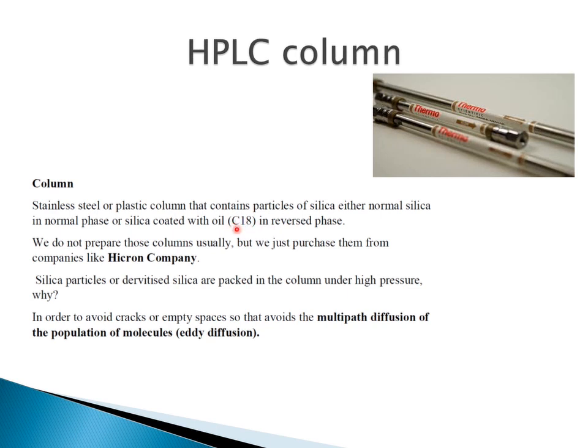It should be done by some well-equipped companies like the Hichrom company. And as you know, the distribution of the particles should be even in order to avoid any possible peak broadening and bad resolution due to the multipath effect and other Van Deemter parameters.